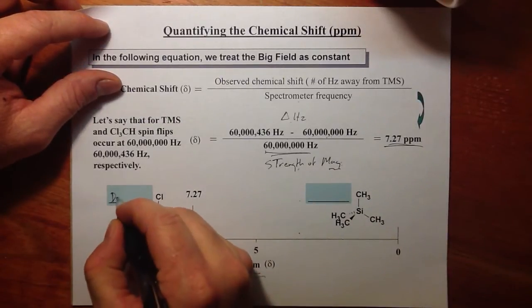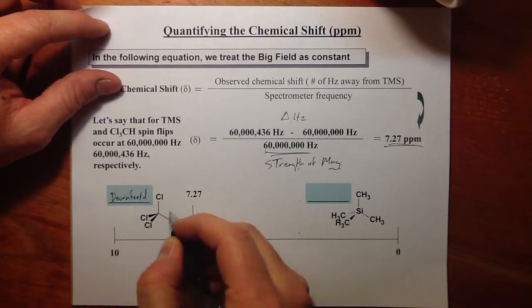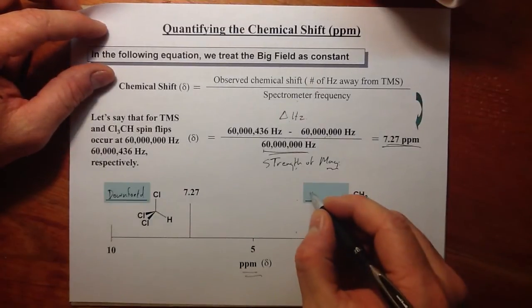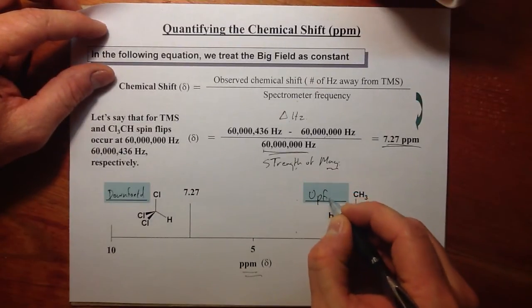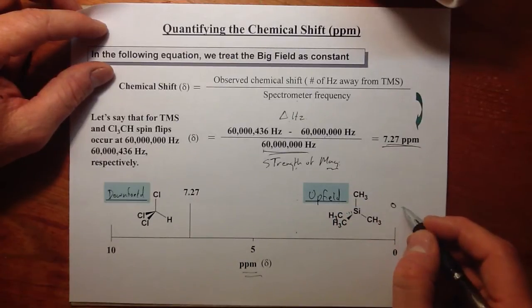This would be, again, the downfield side where we see this 7.27 parts per million, and this would be the upfield side, and of course we would set that at 0 parts per million.